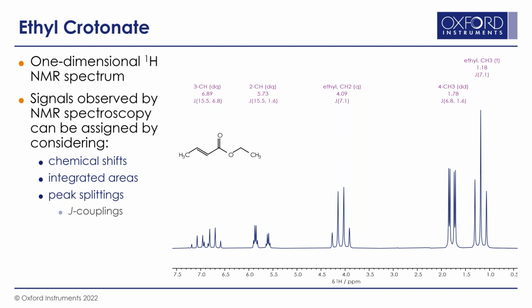The relative intensities of these peaks can be predicted using Pascal's triangle. Thereby, the classical triplet has 3 peaks in a 1:2:1 ratio, while a classical quartet has 4 peaks in a 1:3:3:1 ratio. More complex coupling schemes can arise due to coupling to multiple magnetically inequivalent nuclei, such as the doublets of quartets for the 2 vinylic protons.